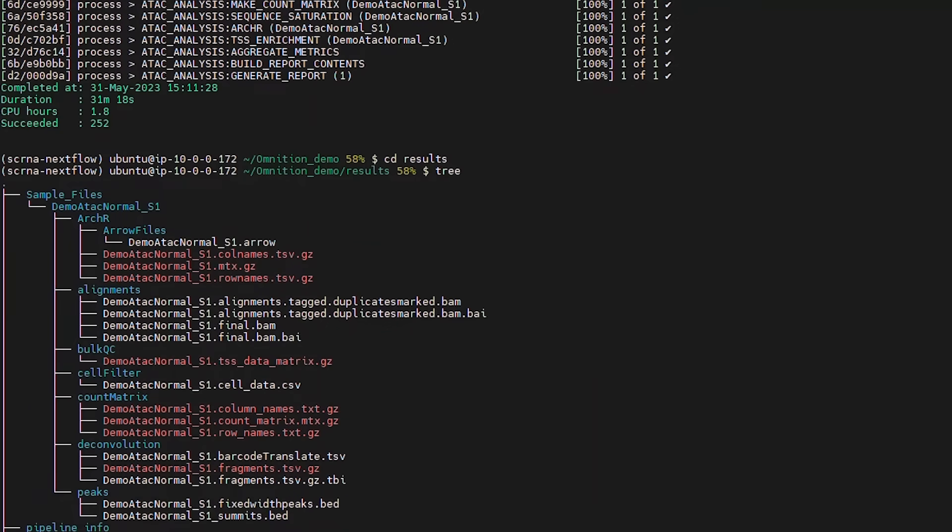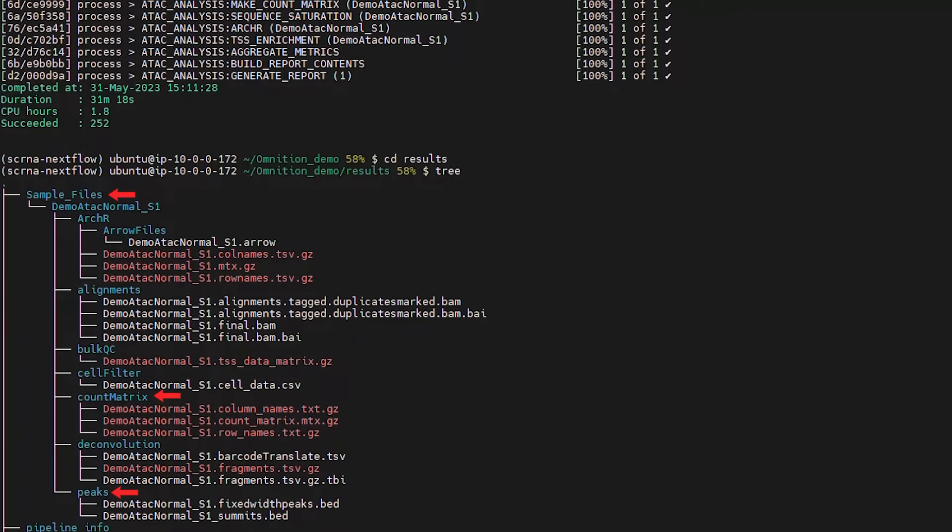In the Sample Files folder, you will find all the output files including count matrix and peak information necessary for downstream analyses. If you analyzed more than one sample, an individual sample subfolder will be included as well.